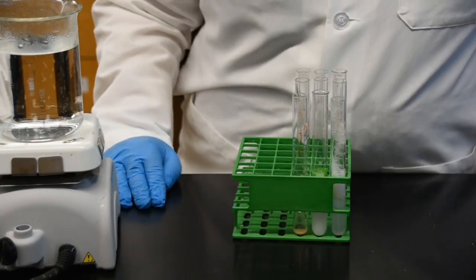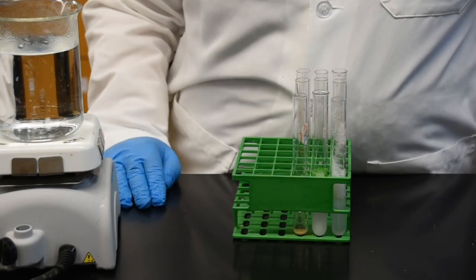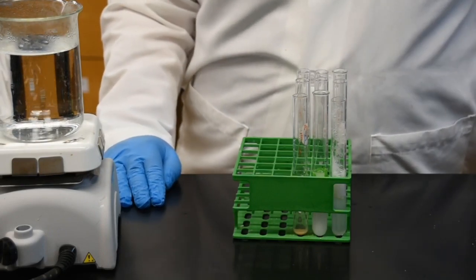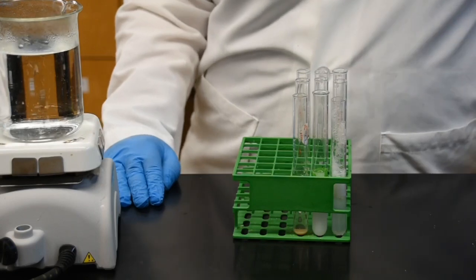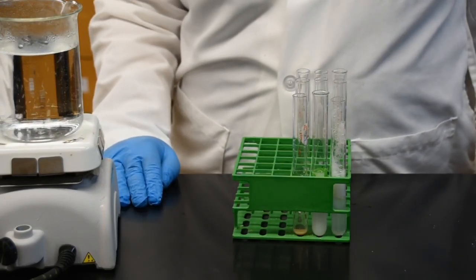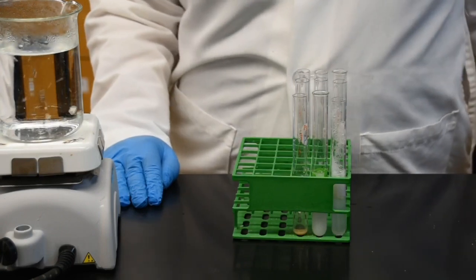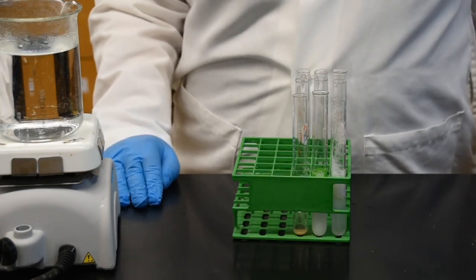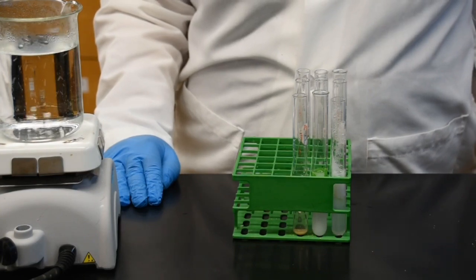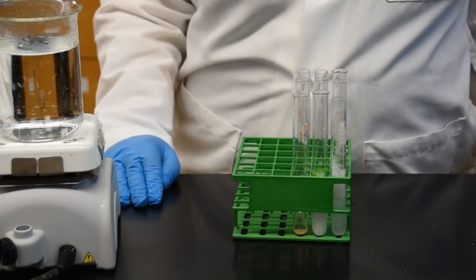For today, we're only going to experiment on 2 of the main food groups. The first is carbohydrates. We're going to look for 2 types of carbs: starch, which is a complex carbohydrate, as well as simple sugars, like your glucose and sucrose. And we're also going to take a look at proteins and see if our sample contains proteins.